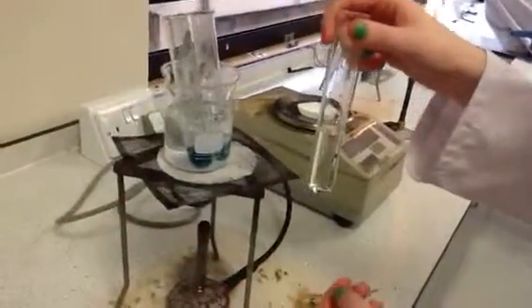Okay Rebecca, we put some more zinc or acid in our solution.